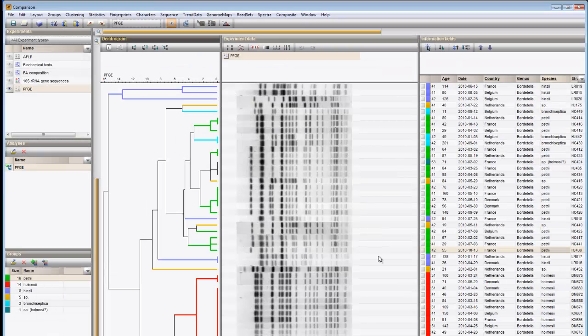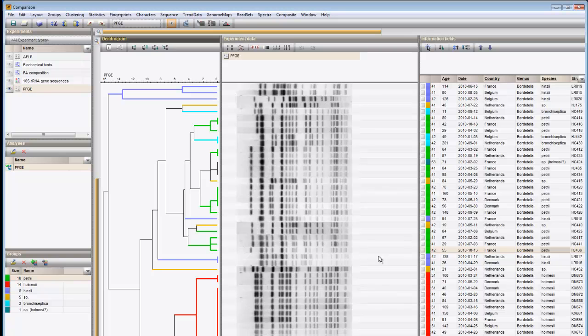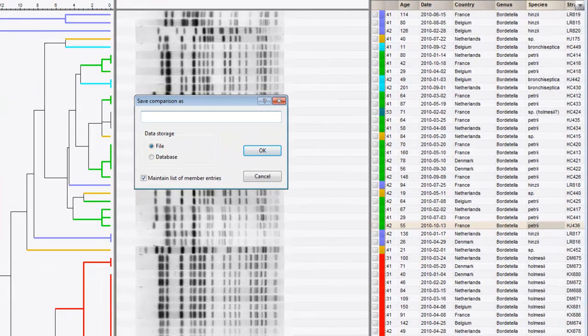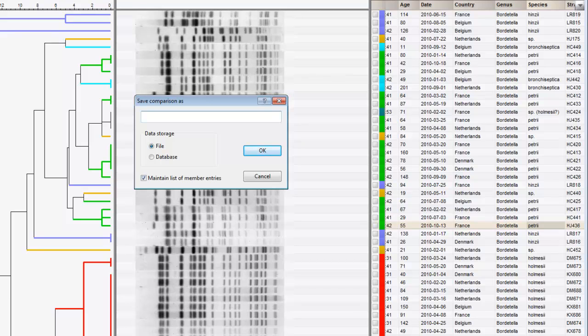Finally, I can save a comparison with all calculated dendrograms, defined groups, and display options set using the Save button. In case of a new comparison, a Save As dialog pops up, prompting me to enter a name. I can choose to save the comparison locally as a file or within the database.